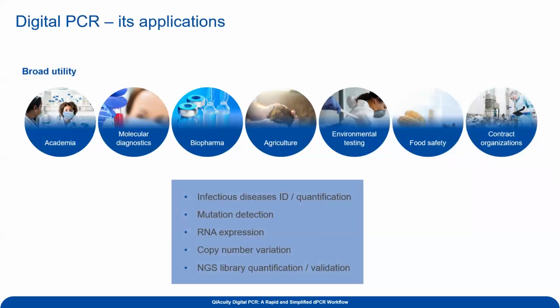So, but where is it actually used? It tends to span a lot of biosectors within the biosciences. So, right, we see it in everything from cell and gene therapy applications, wherein we're titering AAV to determine how much we're actually producing from our production facility or our small scales. We see it in basic academic research across many fields. So everything from environmental DNA to molecular pathogenesis, basically everything there. We see it in oncobiology a lot, and then really in things like food safety as well.